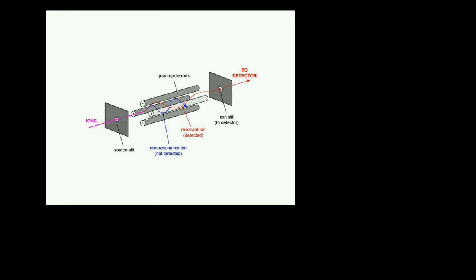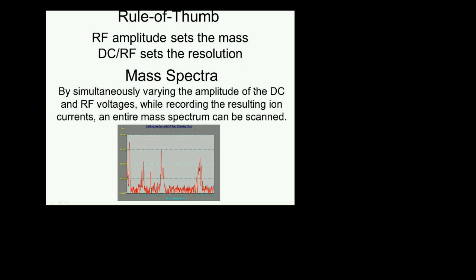If you've ever taken apart an RGA and looked into the quadrupole rod assembly, you'll find that most of the time all the contamination concentrates right here at the beginning, because the ions that don't go through all find the rods and start building up a layer on them. And only one at a time goes to the detector.